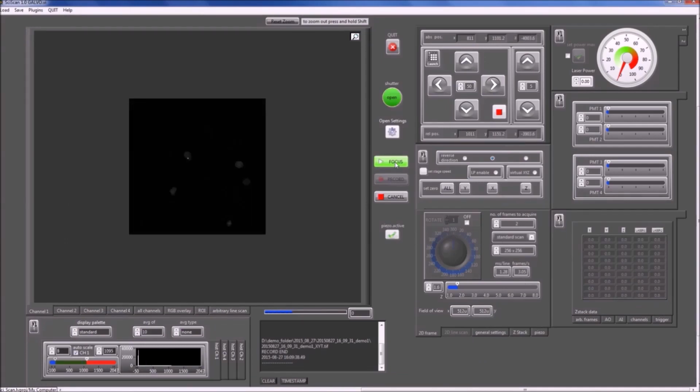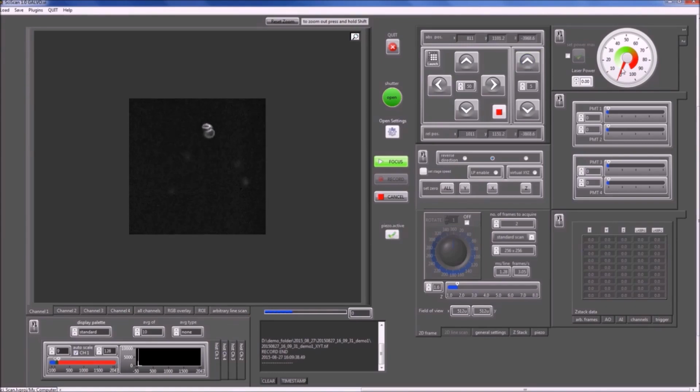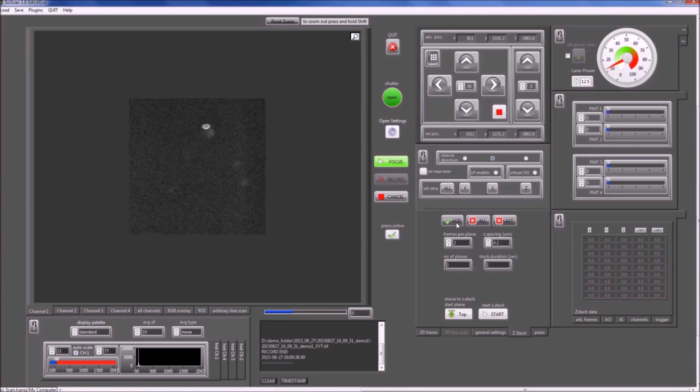The next thing I want to demonstrate here is how to record a Z-stack. So for that I'm just going to choose a starting plane for my Z-stack, just above our plane of pollen grains here. Then I'm just going to adjust the laser power a little bit as well to get the correct excitation power for my sample in this very plane. And then once I'm happy with all those settings, I can navigate to my Z-stack tab here and I add my first reference plane to my list here on the right.